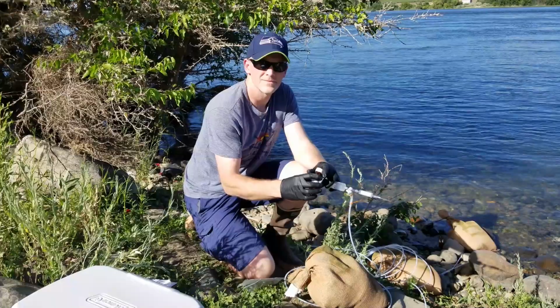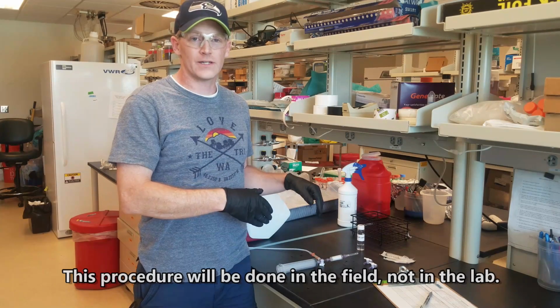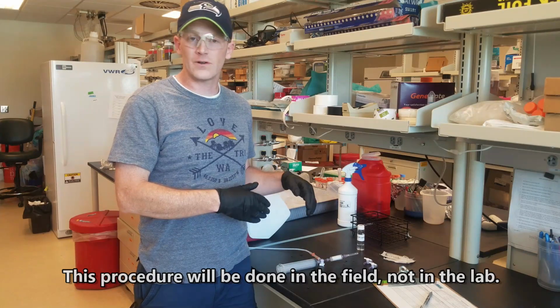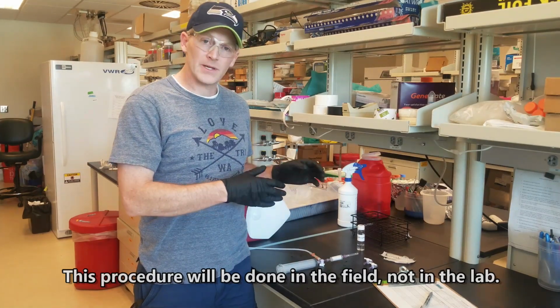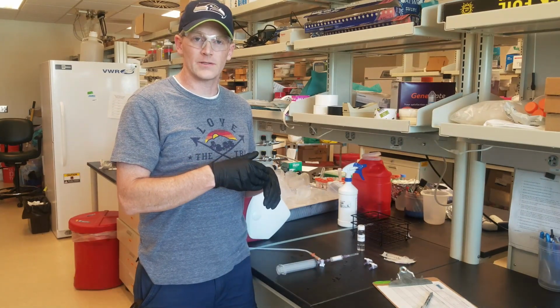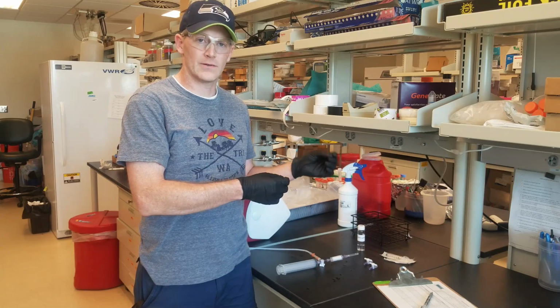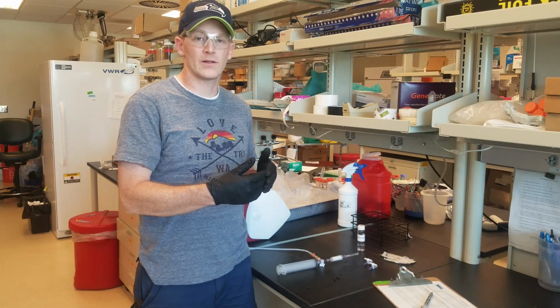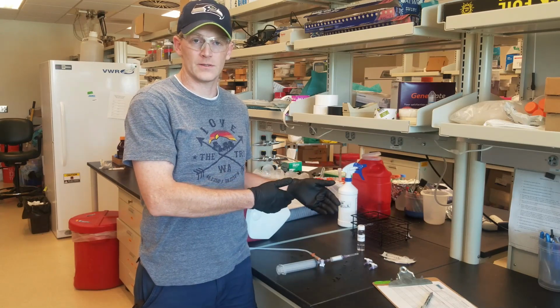sample. Okay, now we're going to go over the protocol for filling the Sterivex filter with RNAlater. That's the preservative that maintains the nucleic acid. We're filming this in the lab, but make sure this is done in the field. You need to do it right after you finish sampling. So for the surface water, you'll sample and you'll immediately do the RNAlater for the surface water Sterivex. Then you'll move on to the push point sampling, do that sampling, and then preserve that filter using this protocol.